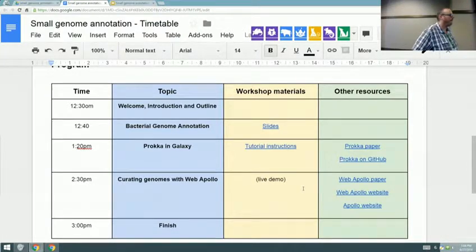As soon as you touch a file, it downloads and caches it. It's basically for read-only data and beautiful for reference data sets. It sounds good, but it's not helping Joe Blow on his MacBook who's annotating a gene. If you're doing bioinformatics on your MacBook, it's not going to help.